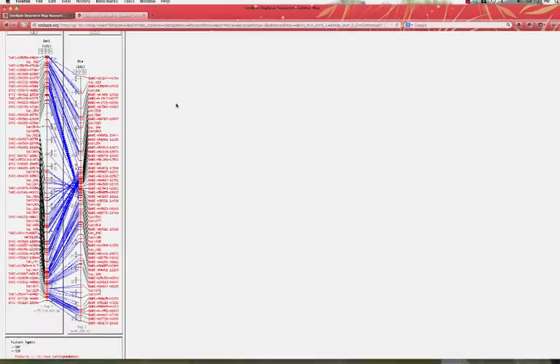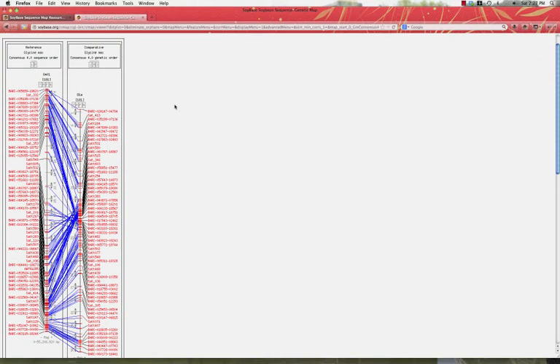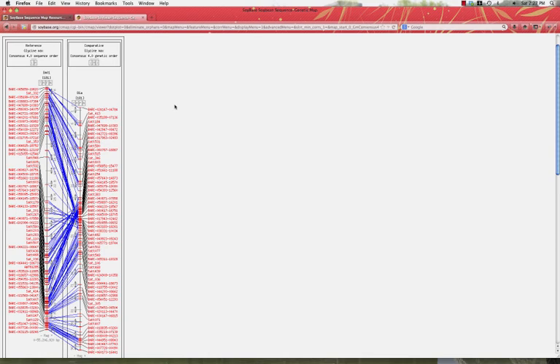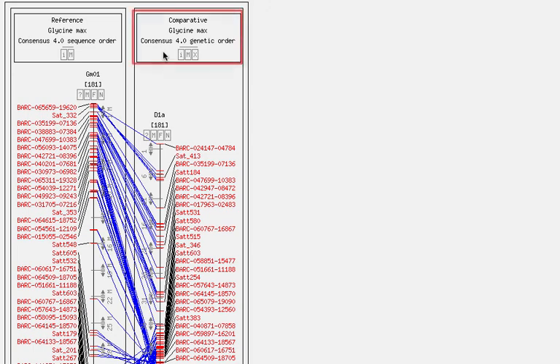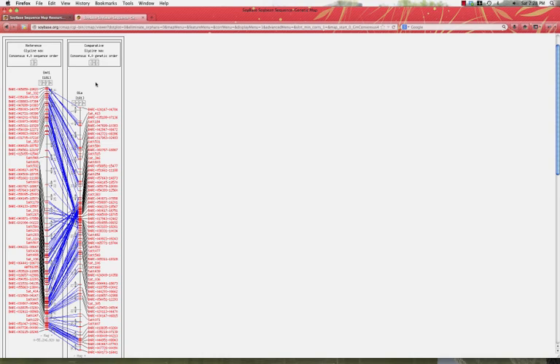You'll be presented with your usual CMAP display, but in this particular display, you are presented with not the consensus and composite maps, but actually the consensus 4.0 map in sequence order versus the consensus 4.0 markers in genetic order. In other words, we can compare the assembly of the physical map, the sequence map, versus the assembly of the genetic map.